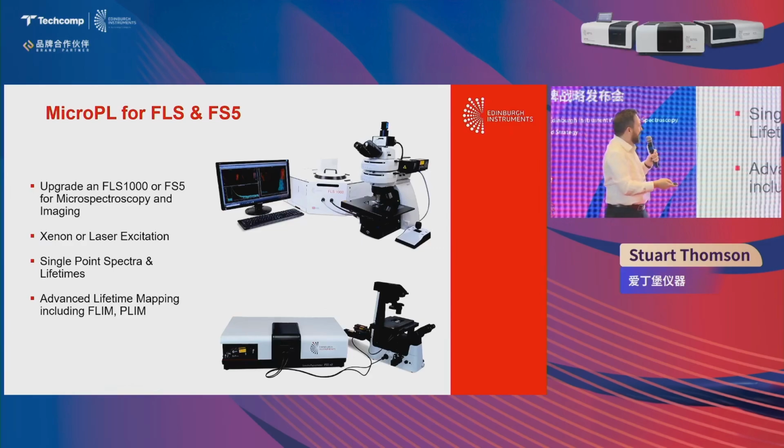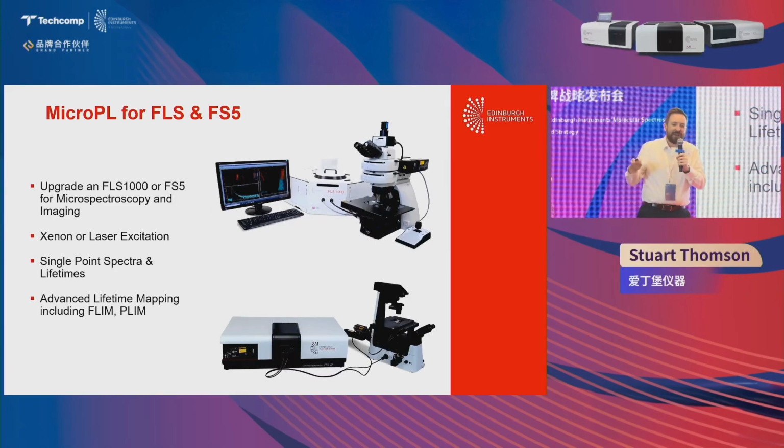And so with the micro-PL, you can excite your sample with either the xenon or laser excitation and measure single-point spectra and lifetimes at different positions on the sample, and also FLIM and PLIM photoluminescence imaging.